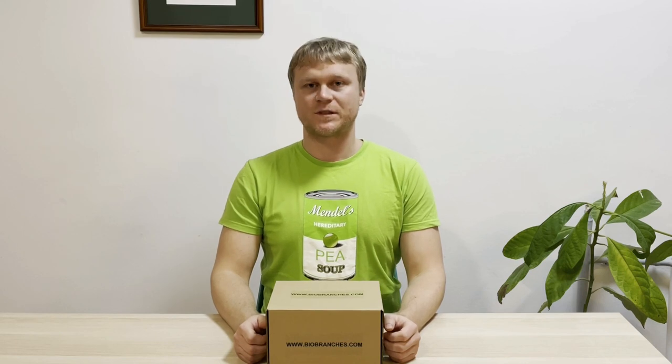We are going to convince you that it is possible to study biochemistry not only in the laboratory, but simply at home. We have a box that contains all reagents, but excluding the food ingredients, since we can find soft fruits, such as berries, in our own fridge. We'll use bananas, but instead of bananas, you can easily take some berries or other soft fruits.